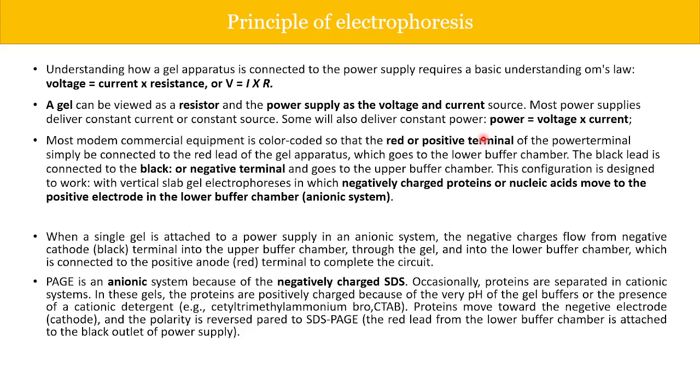Okay. So the principle behind electrophoresis is that we need to understand how the gel apparatus is connected to the power supply based on Ohm's law. So you have the voltage, V equals IR. Here you have to consider three factors: voltage, current, and resistance.